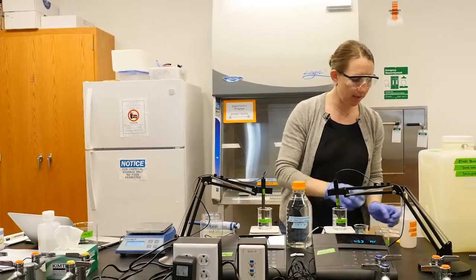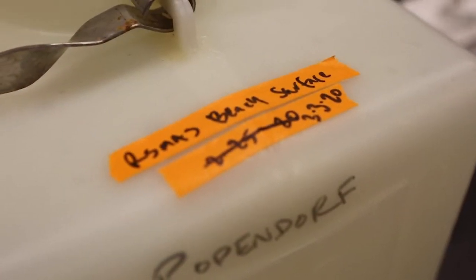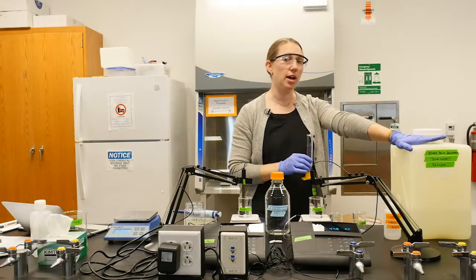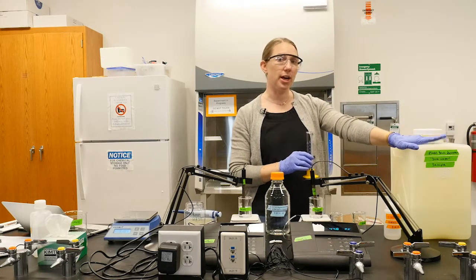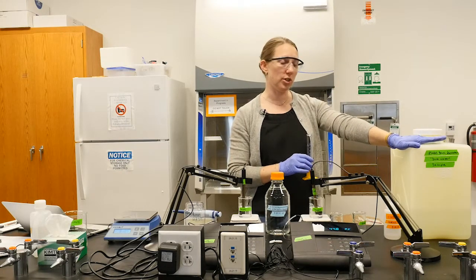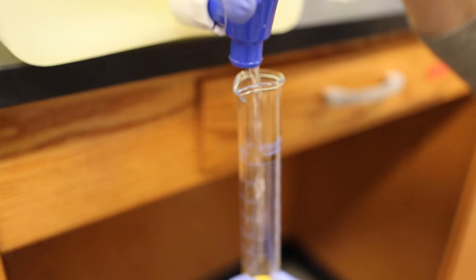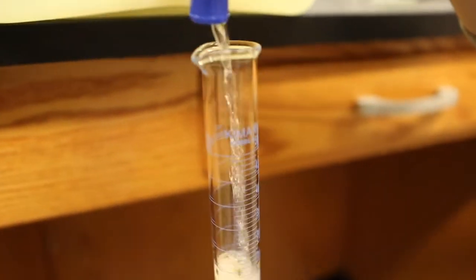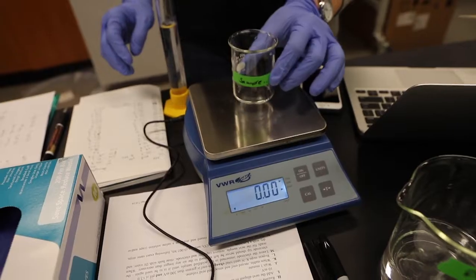Then we're going to do the same thing for our seawater sample. The sample that we're going to be measuring today is seawater that was collected at Rasmus Beach. We collected it off the dock there, so we often call this dock water. So this is coastal seawater, and we'll be measuring the total dissolved CO2 in this coastal seawater. So we're going to get our 50 milliliter sample. So we have our 50 milliliter seawater sample.